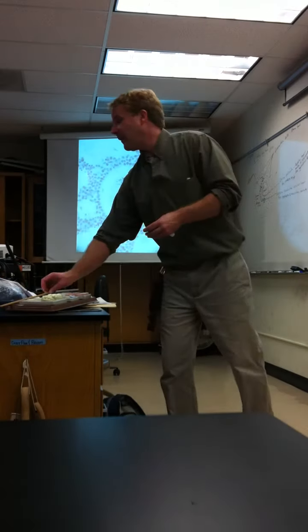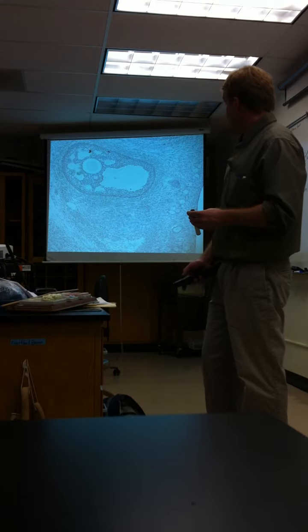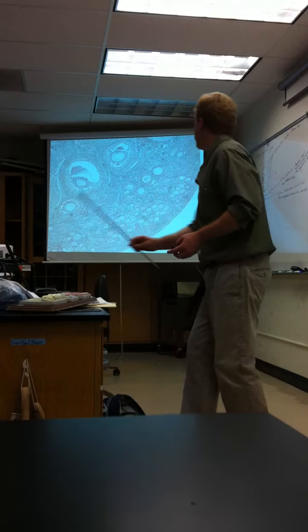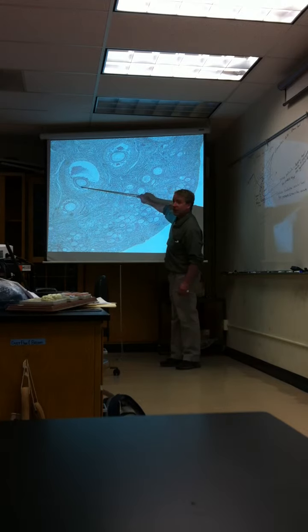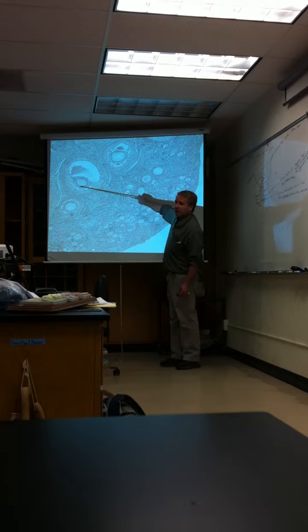So now we have gone over the ovary slide. Just to show you, some of your slides may look like this. And so in this particular slide, it could be a little more difficult to differentiate zona pellucida. What is the cellular layer at the tip of the pointer there? Corona radiata. I definitely can see corona radiata. Zona pellucida and the oolemma, not so clear. And so I would only point to it where it's very, very clear.